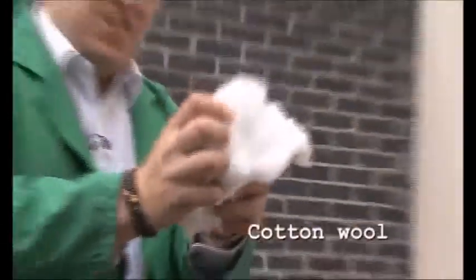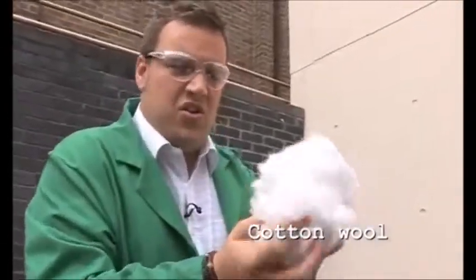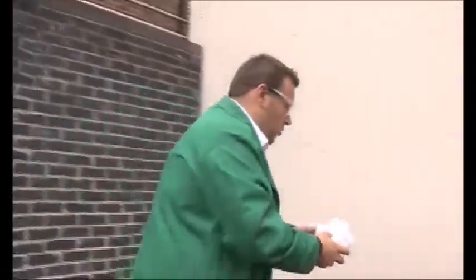And you can see here the lovely blue colour. Now lots of chemists are really scared when they see the blue of liquid oxygen, because liquid oxygen is very, very reactive. Generally you only make liquid oxygen by mistake, not like today when we're making some on purpose. And if you've made it by mistake in an uncontrolled way, where there might be organic molecules, perhaps simple organic chemicals like hydrocarbons, grease, or perhaps a highly elaborate compound, then they tend to detonate and they tend to cause very energetic experiments. So, you know, it's really fluffy, it's not very reactive, doesn't really burn, might smoulder, but here we go. We're going to pop it in the tray.